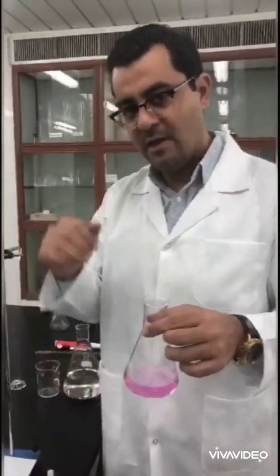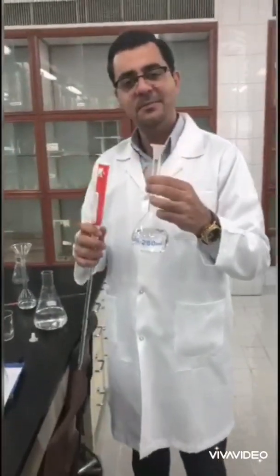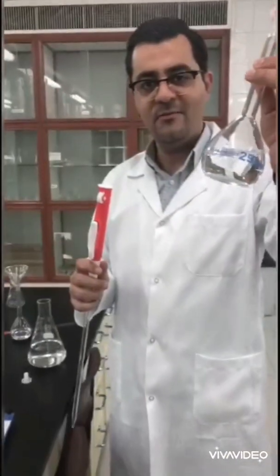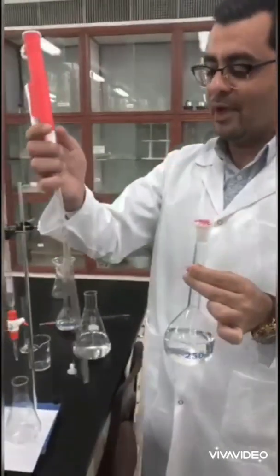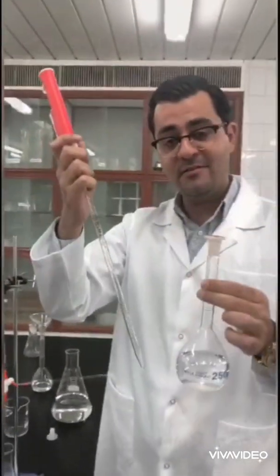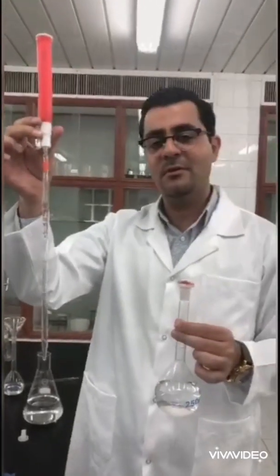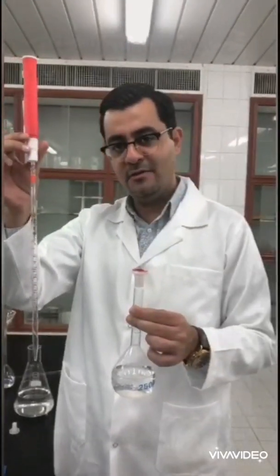Last step: here I have HCl in this volumetric flask. I will take exactly 10 milliliters using this device. This is called the pipette. It's more accurate than a graduated cylinder.